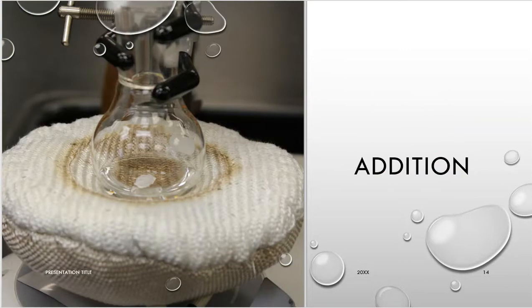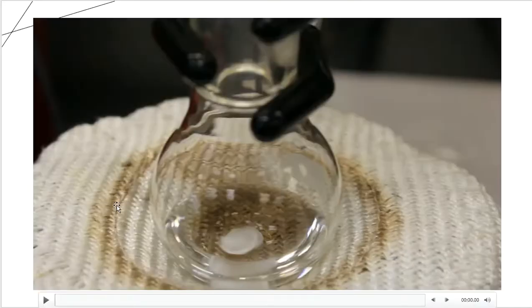So here's a close-up of the addition. The anisole is inside of the flask, and the methylene chloride is inside of the flask. Nothing major has happened here, as you can see. I mean, it still looks clear. It's colorless. No bubbles. Nothing really going on as far as anything that I need to make a note of for an observational change. However, statements like no observational change are just as important as if there were changes that happened when I added reagents together. Okay, so now in this video, you're going to see just an actual video of the next part of the lab experiment.